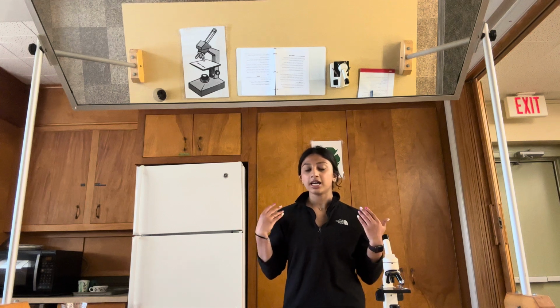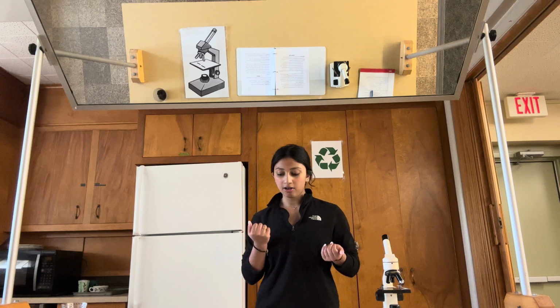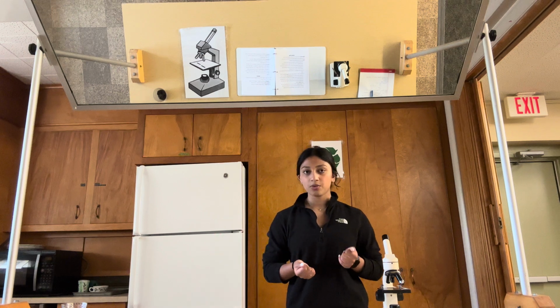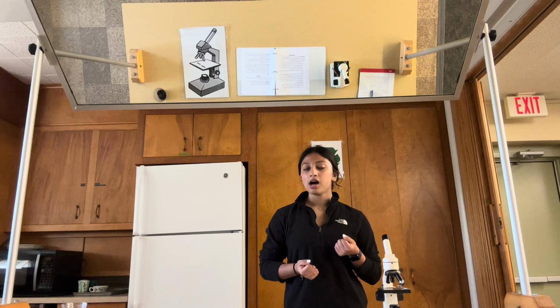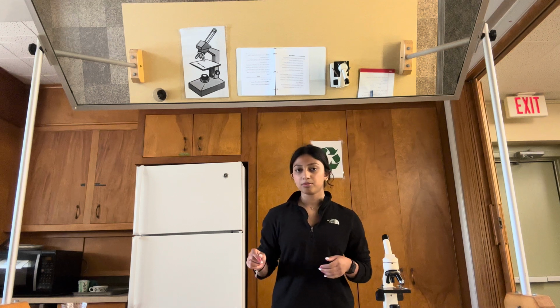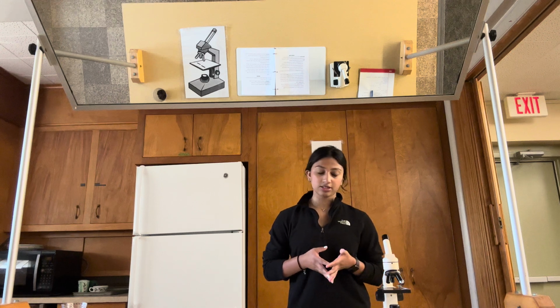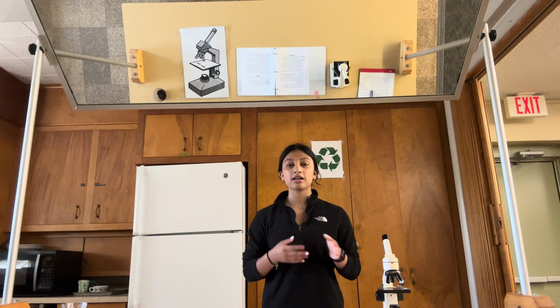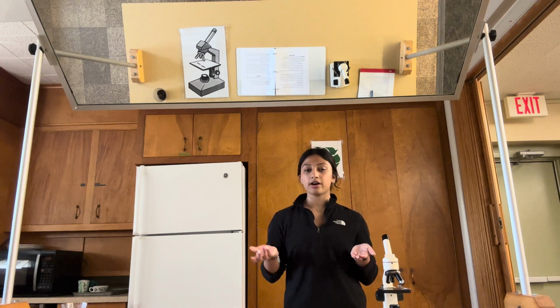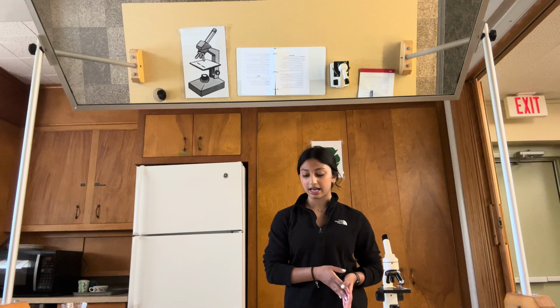These will include hair and an optional cheek cell slide, where the students will swab the inside of their mouths with a Q-tip and prepare the slide to view their cheek cells in the microscope. This is optional, and the students will also have the choice to view pre-prepared slides.